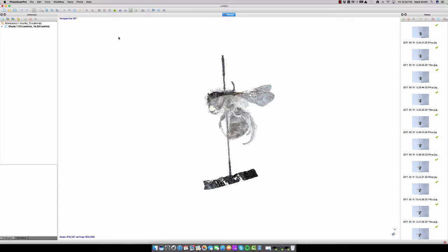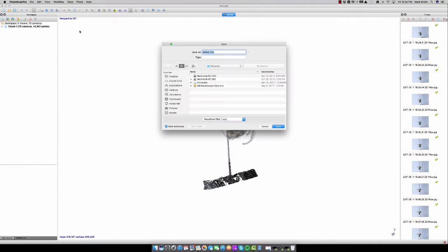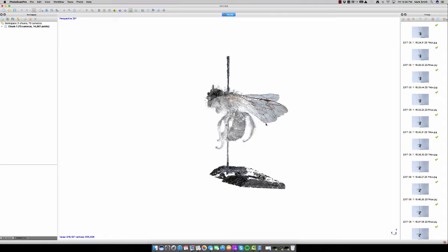Just want to say that the last thing to do is to export this model. So if you do want to export, you can export the model using a variety of different file types, as an object file, an STL. Object files will preserve color in certain viewers. It's one that we like. Autodesk files are pretty good, and so forth. So you have lots of export options and so forth, and the models are there for you to use however it is you wish.